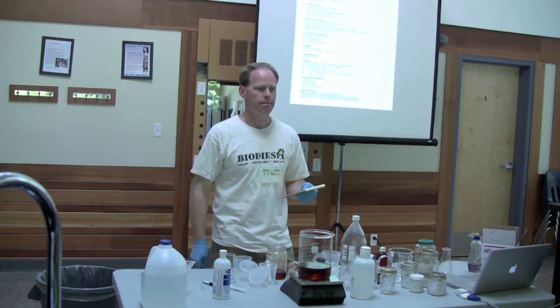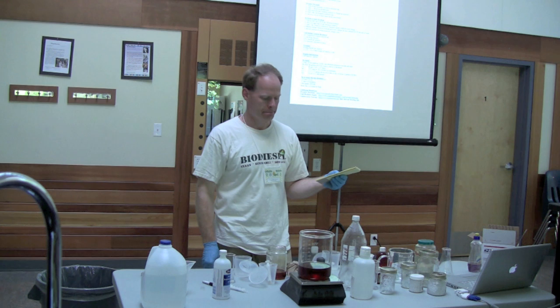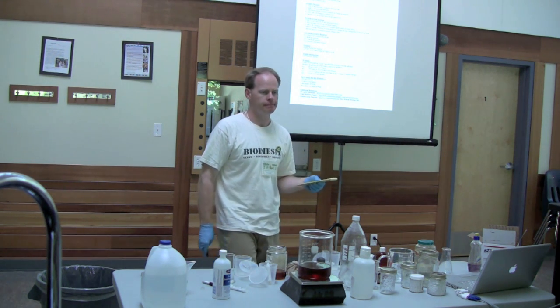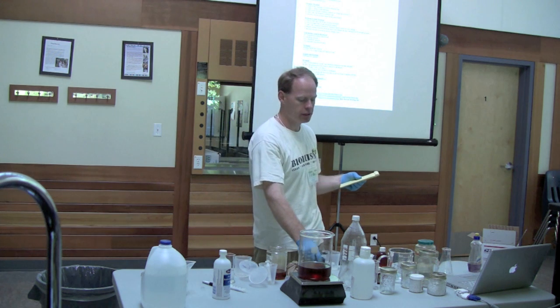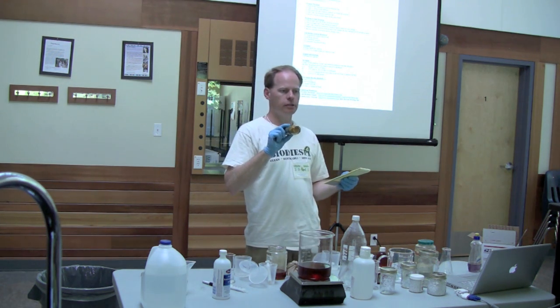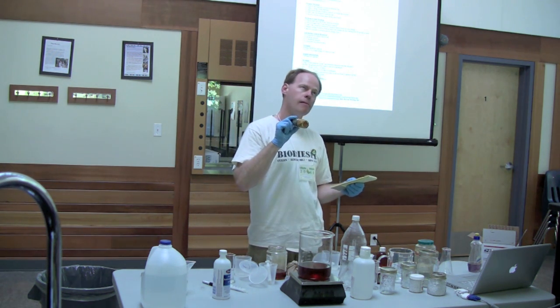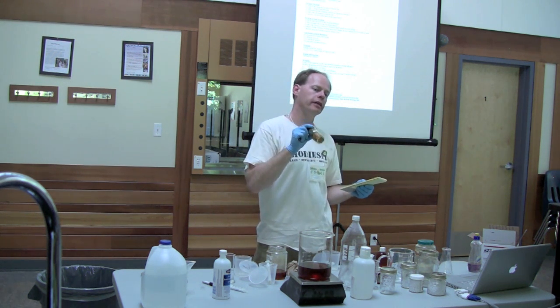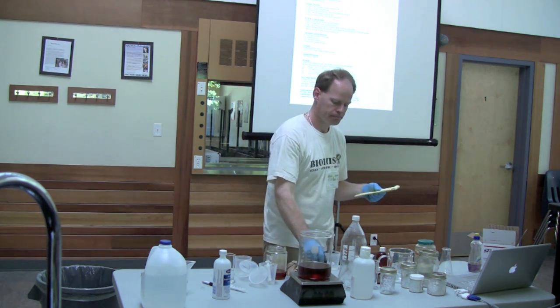What pH did the turmeric change at? Do you know? I don't. I'd have to pull it up. There is an article on it where someone compared it, and my guess is that it changes color at a lower pH than phenolphthalein, so it'd be slightly more accurate, closer to 7.